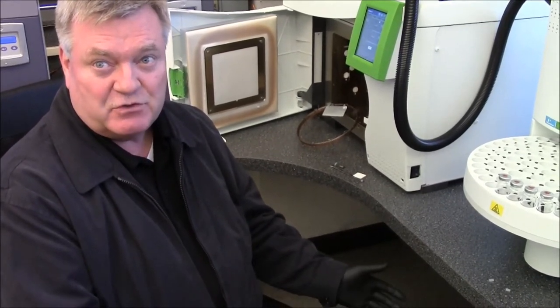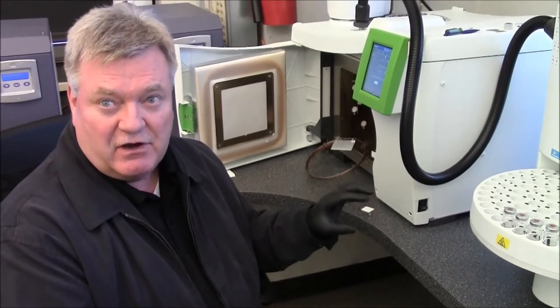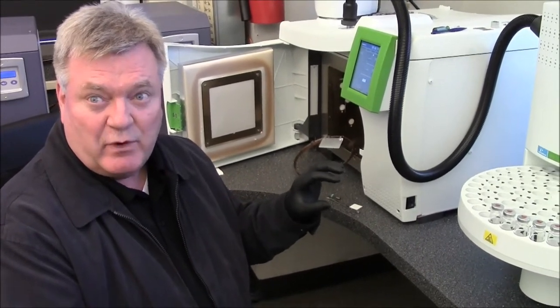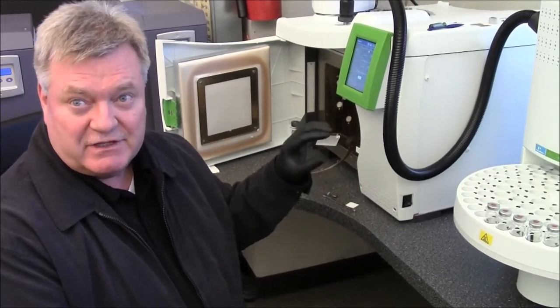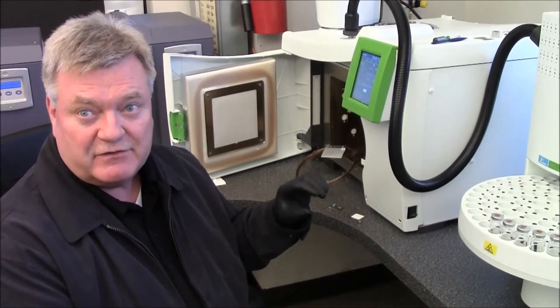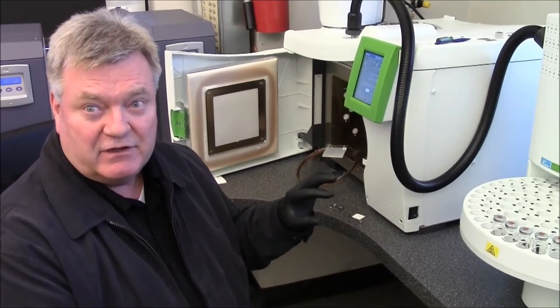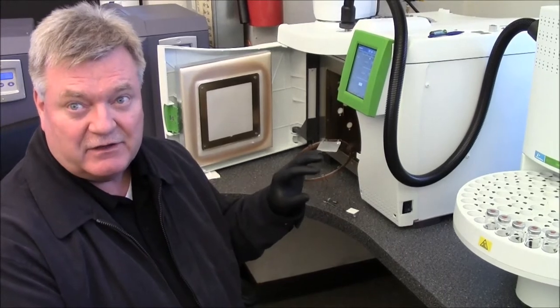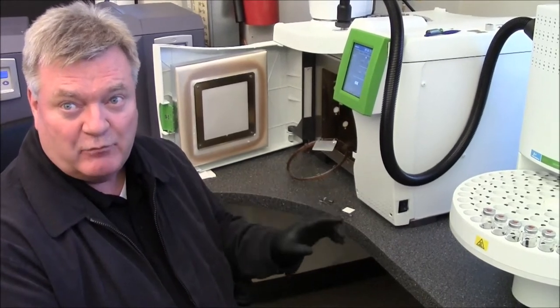If you ever have a leak, sometimes that will destroy your column. Or if there's no carrier flow and it gets heated up, then it will destroy it because the stationary phase inside of the column is actually kind of a wax type material. If it doesn't have the carrier flow going over it to kind of keep it cool, kind of in a rigid state, then it will actually just melt like wax and pull to the bottom.